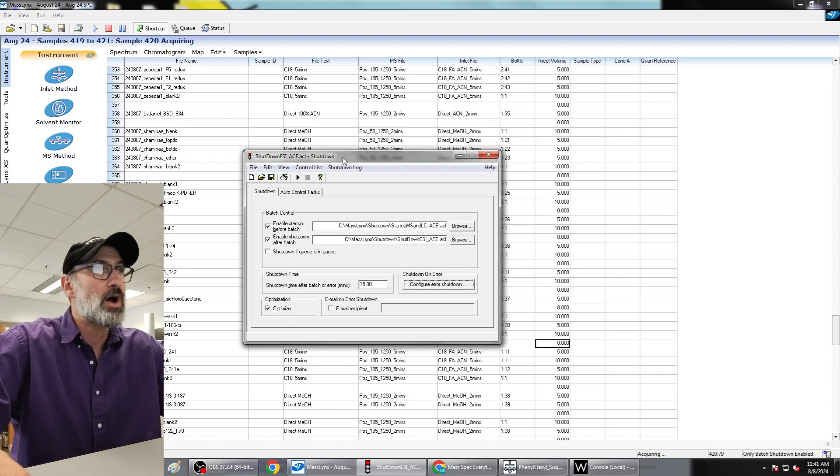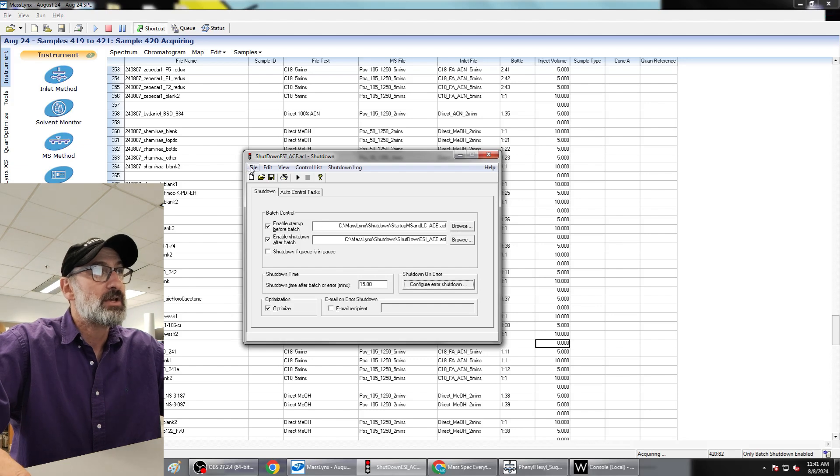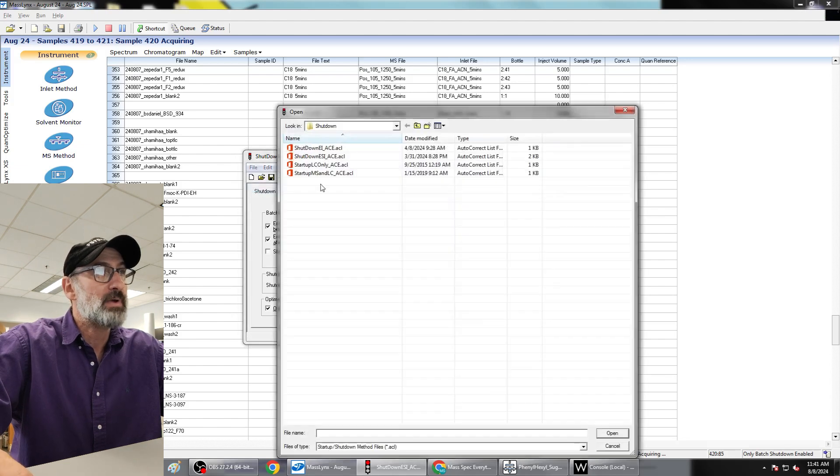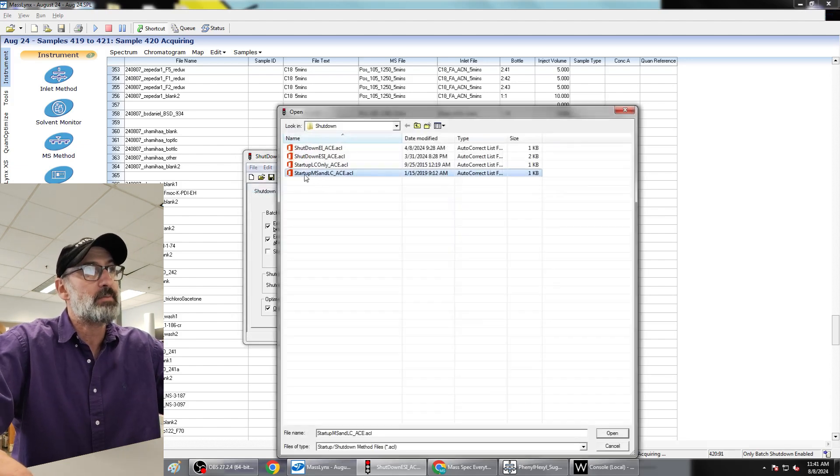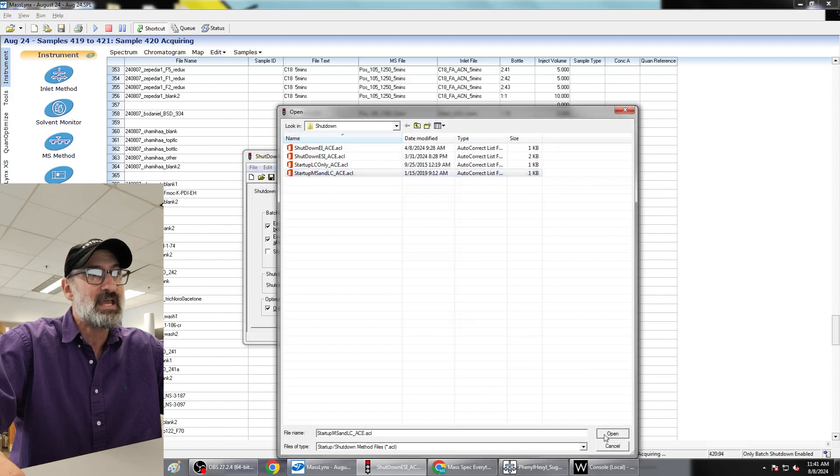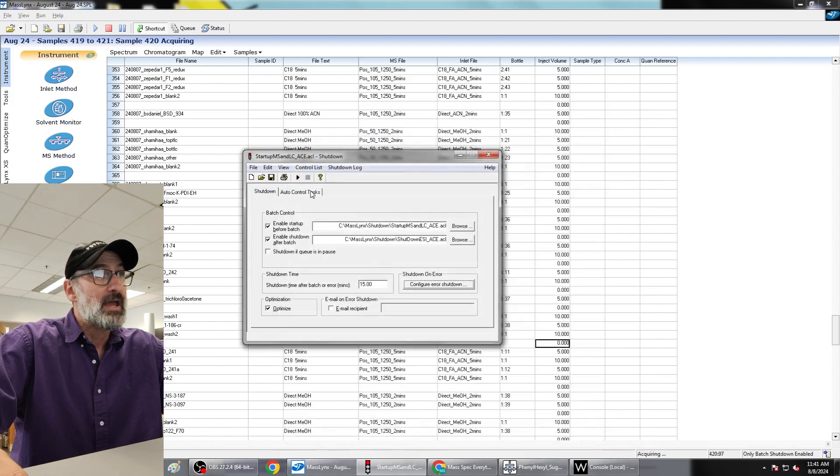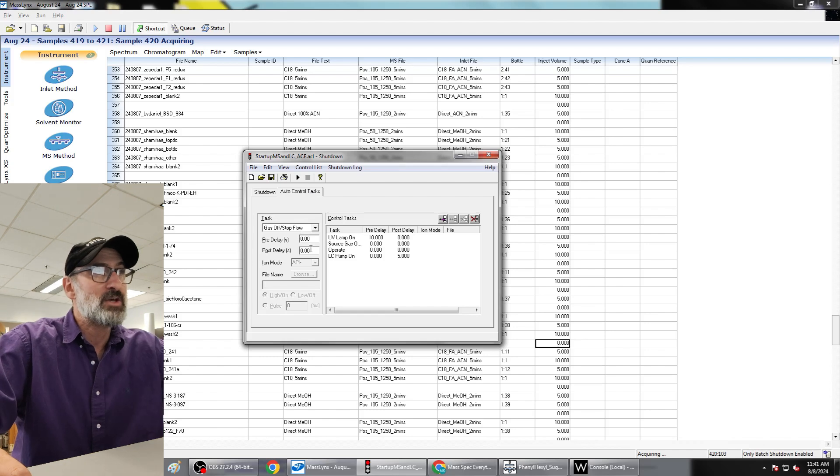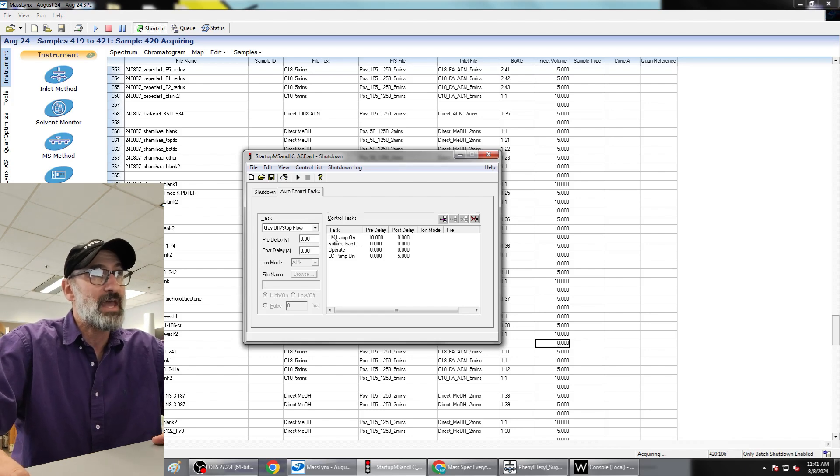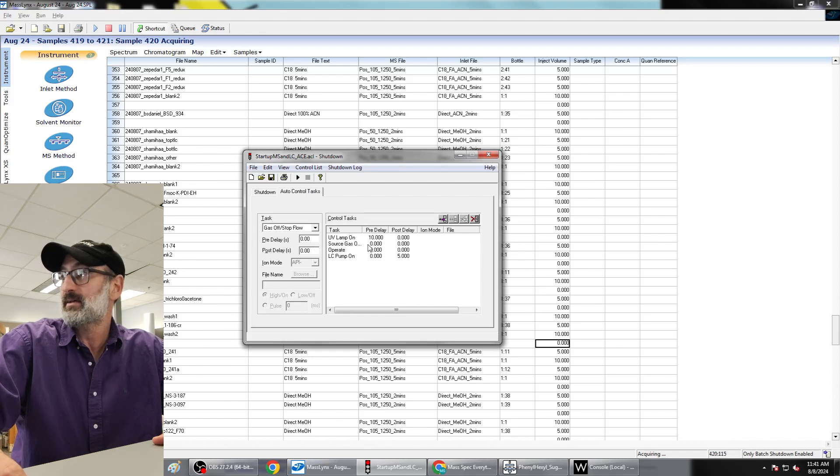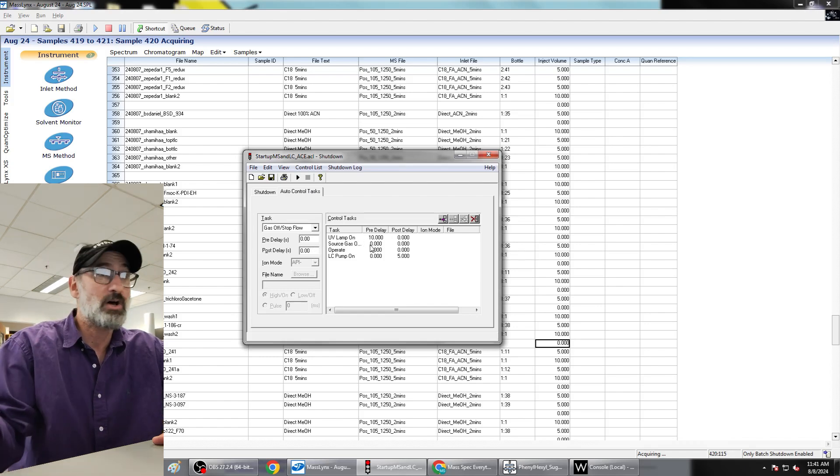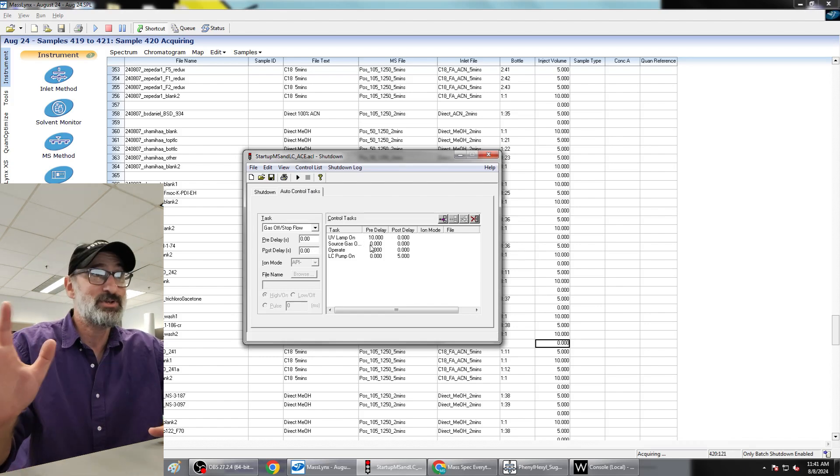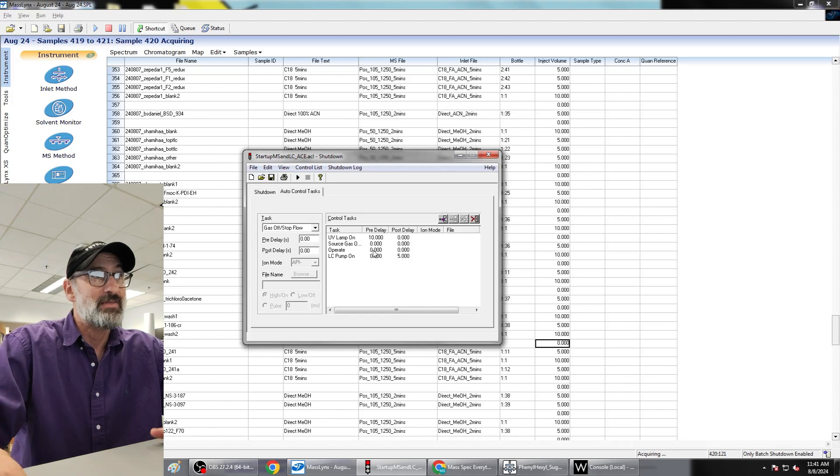So now let's go through auto control tasks. You're going to go to file and you're going to open. We're going to do my startup first. We're going to open up my startup MS-LC ACE and then we're going to look at the auto control tasks. And you can see this is the order of events that I have going on. So UV lamp on first with a 10-second pre-delay. It takes a long time for the lamp to turn on, so you might as well do it first.